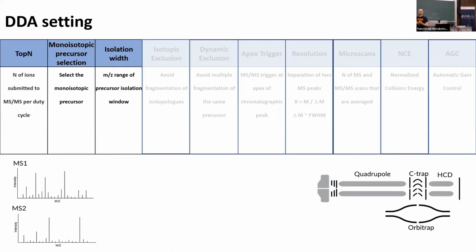So I don't know if they fixed it in the meantime, but that was certainly something you had to know, because I'm used to like 0.5 m/z isolation width for the QExactive or 1 m/z. But if you use that on our old Maxis, then you probably would have gotten really low signal to noise for your MS/MS. So yeah, here this needs to be optimized.